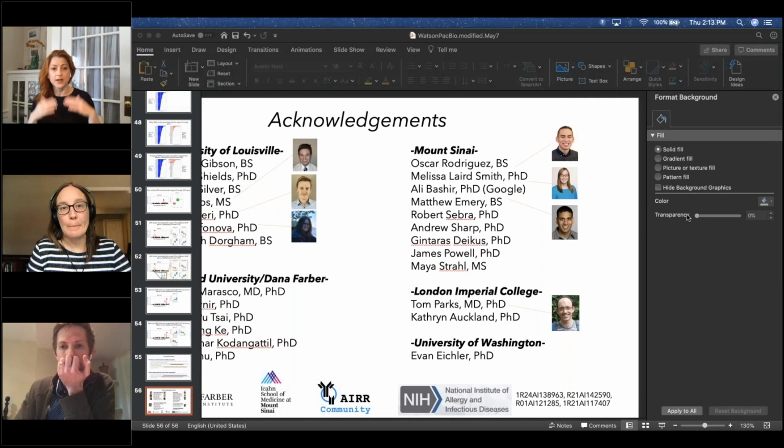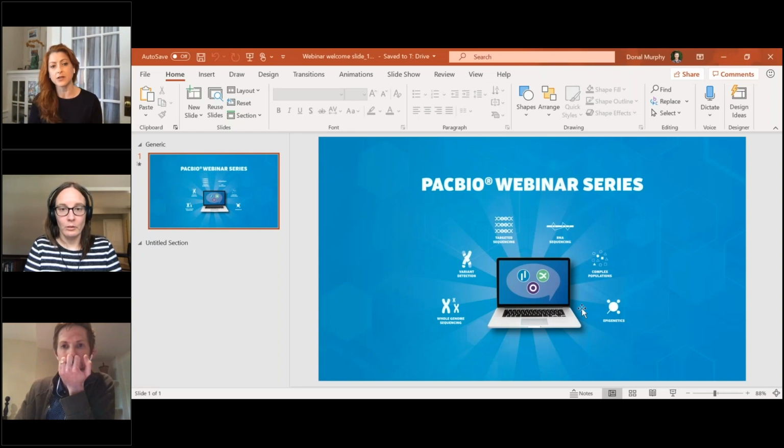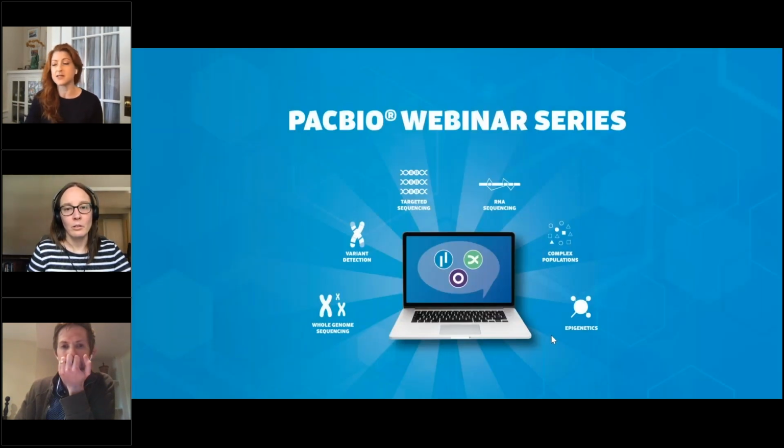So I guess I'm going to say that we're going to do both. We can start right now optimizing the primers using the cultured virus control that we have, and then when we get results back from our collaborators on patient samples, we'll do a comparison of the coverage for that, and also the coverage for the control sample, and see if there are differences.